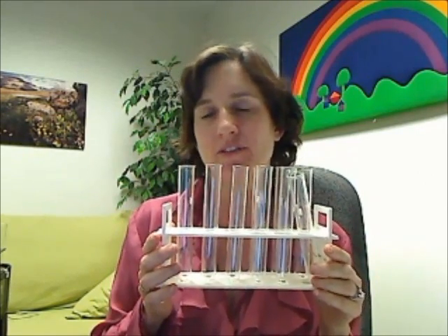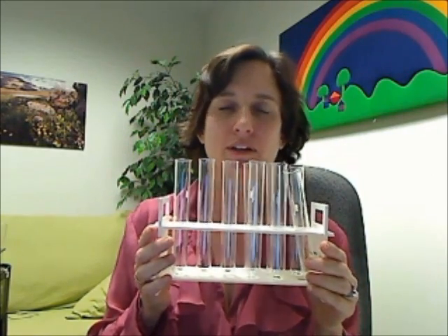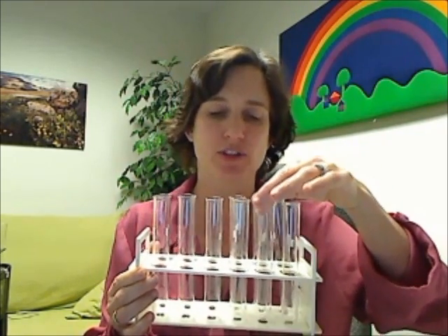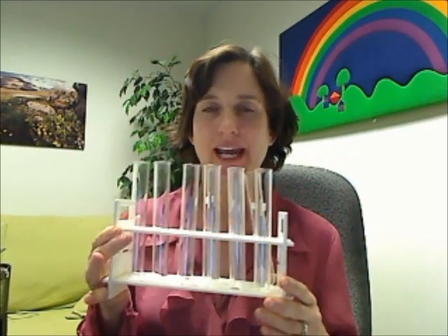Now, the main supply that your lab group is going to need, and you can work in lab groups, I would say, of up to 4. If you really want a larger lab group, talk to your sub about that, and that's pending their approval. But each group is going to need 10 test tubes, and each of these test tubes is going to house one of those mystery powders. So there's A, B, C, D, E, F, G, H, I, and K. J is the one I took out, so there's no J.